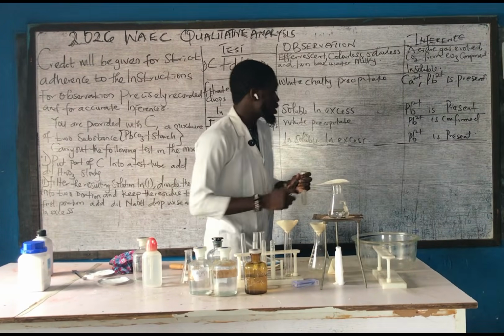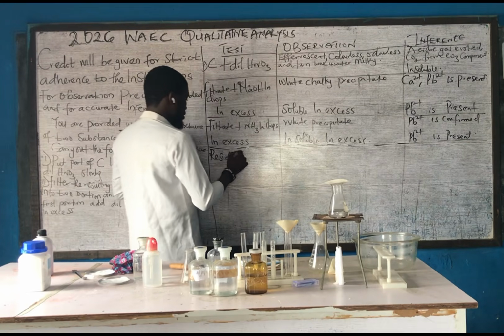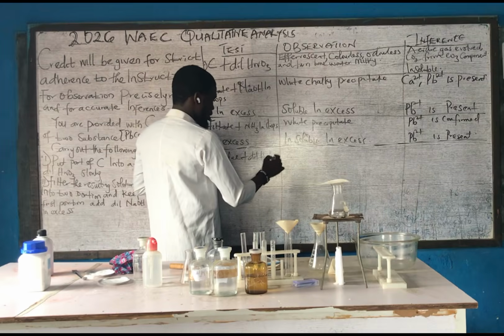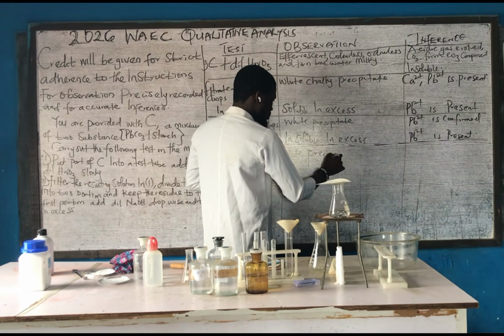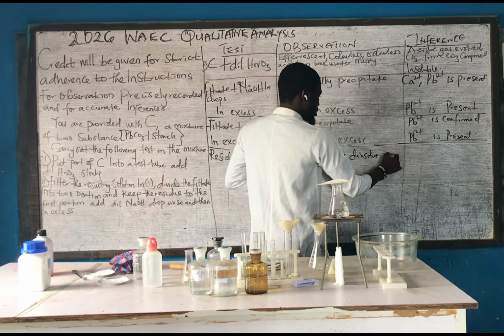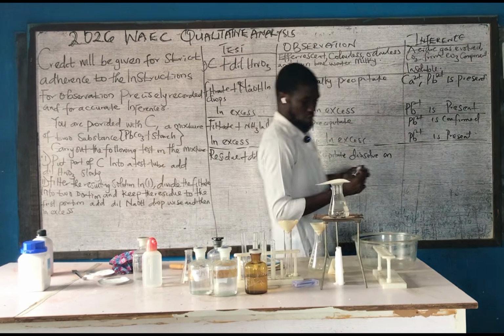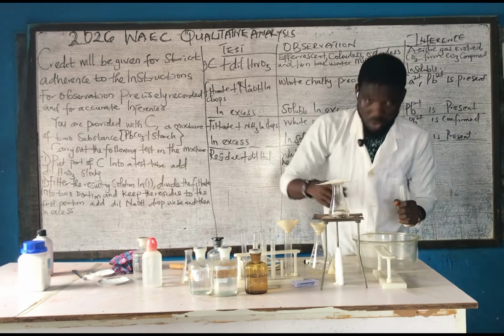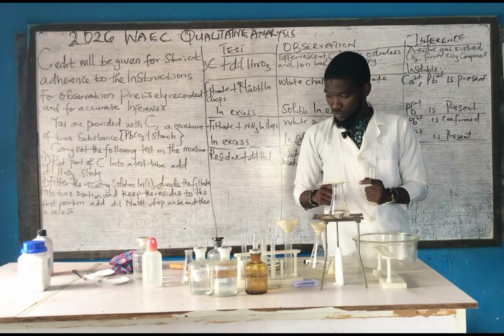So you can say residue plus dilute HCl, white precipitate, dissolves on heating. Now we have warmed this already. So please get me the matches there, please.